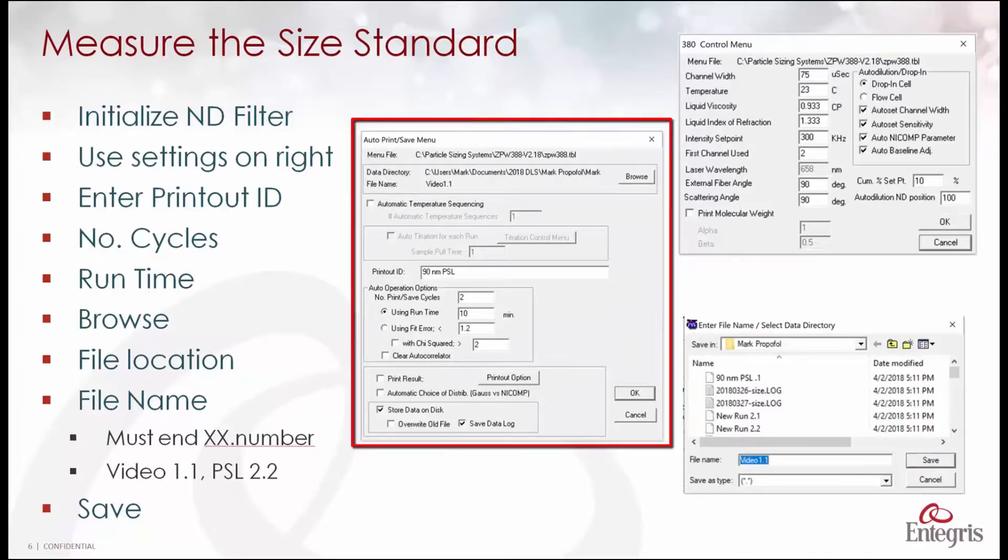Here we're looking at the auto print save menu where we enter the printout ID and we've decided to make two measurements of 10 minutes each.